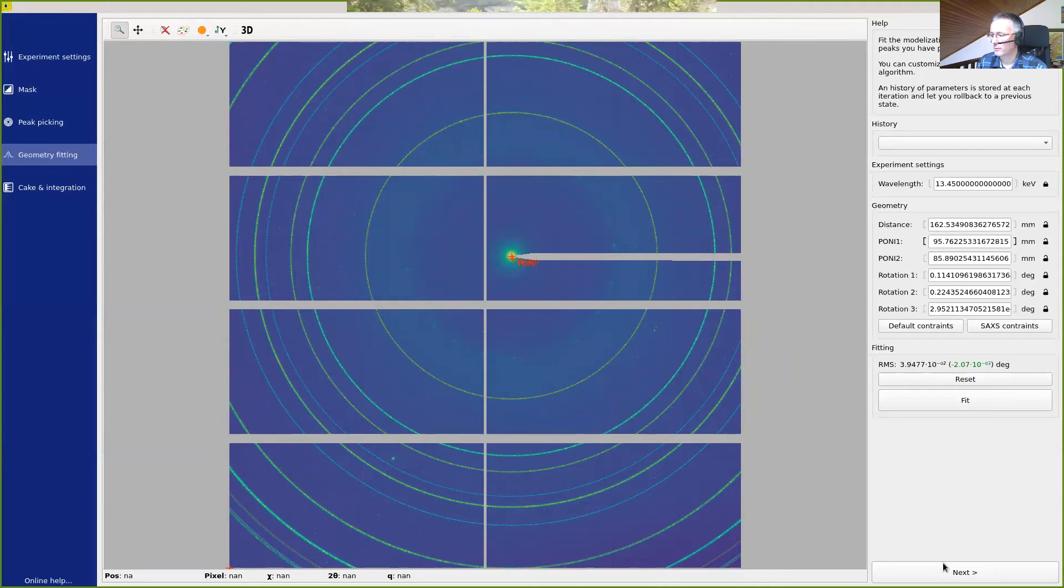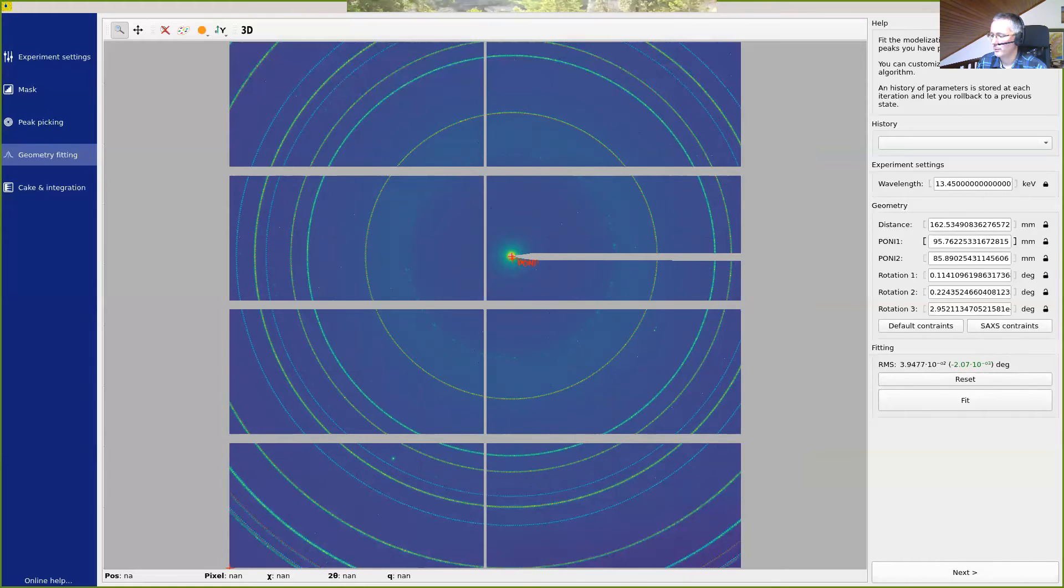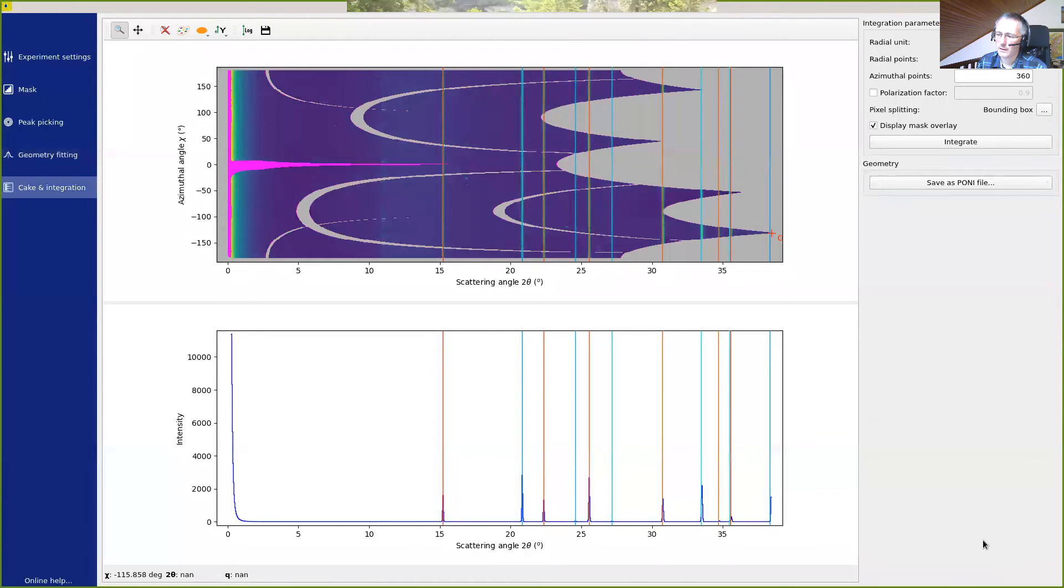So with this, we have a pretty good calibration. We could lock or unlock whatever parameter we want. And now the last step is to perform the integration.